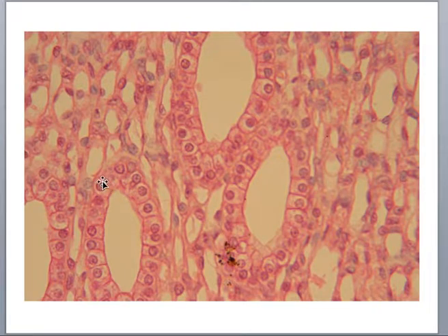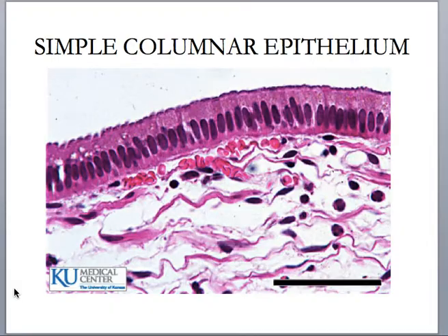It's because these cells are producing a product that gets secreted, and so they're a little bit fluffier because lots of production is going on in these cells, okay? And that product is being secreted into the lumen. So if I have the pointer here and I'm pointing to this layer of cells, the specific would be simple cuboidal and the general would be epithelium. So simple cuboidal epithelium, a single layer of cube-like cells. And I'll ask it in a tubule form.